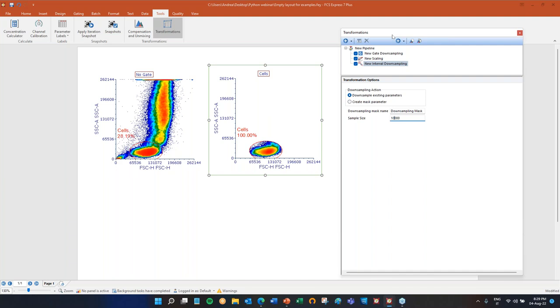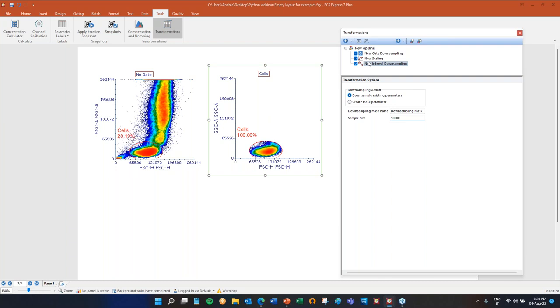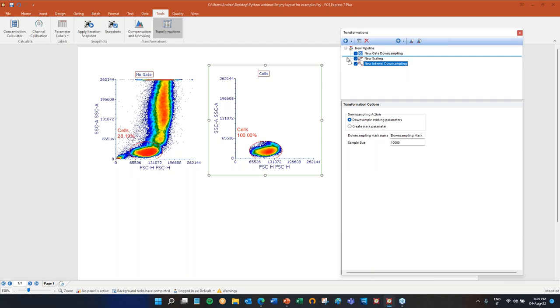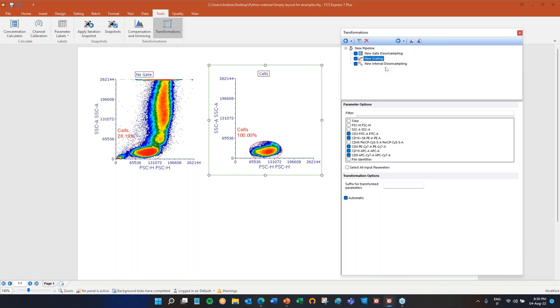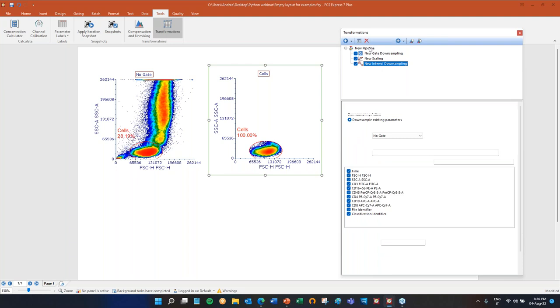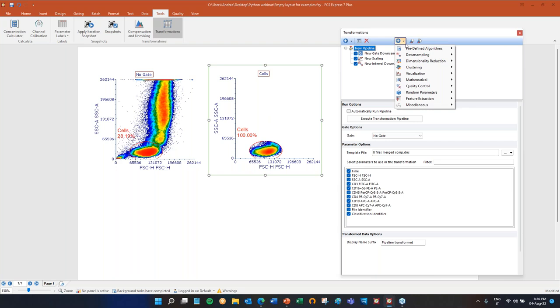Step one: gate downsampling — we want to gate on cells. The first step of our pipeline will simply be a gating step. Then let's do some basic pre-processing: scaling. Remember we have an entire webinar about scaling — it's really important. We want to scale some parameters of interest. Then we can add downsampling — there are many options. I'll do something straightforward: interval downsampling, let's say 10,000 events. Since order really matters, you can also reorder steps — move interval downsampling upstream or downstream of scaling.